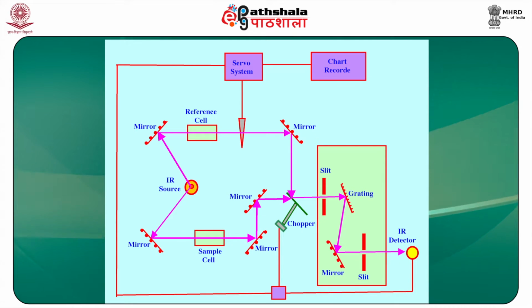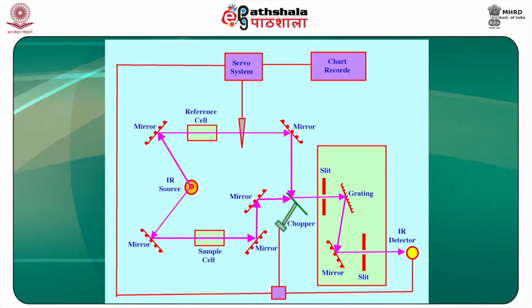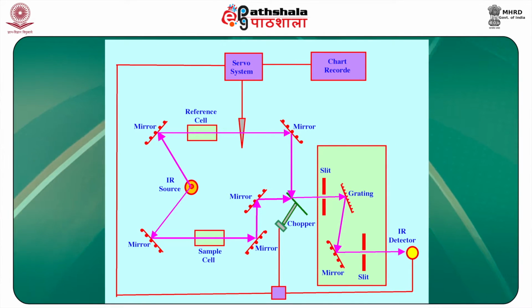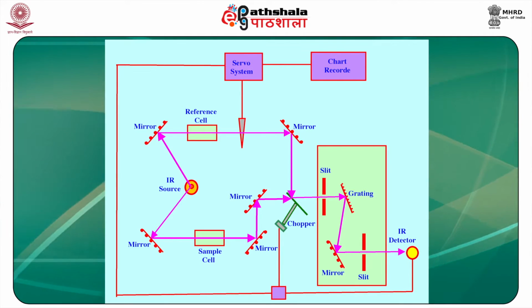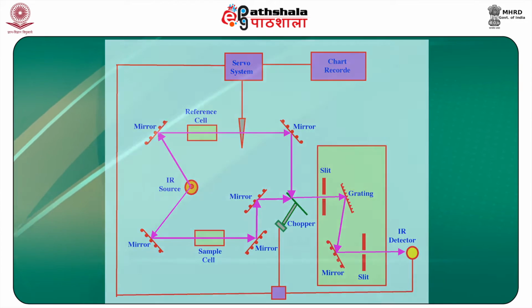The infrared absorption traces of a substance are individualistic in nature. If the patterns of absorption of the infrared rays of the crime scene sample correspond with the standard sample, then the common source may be identified. IR, or infrared spectroscopy, is defined as the spectroscopic technique that deals with the infrared region of the electromagnetic spectrum, that is, light having lower frequency and longer wavelength as compared to visible light.